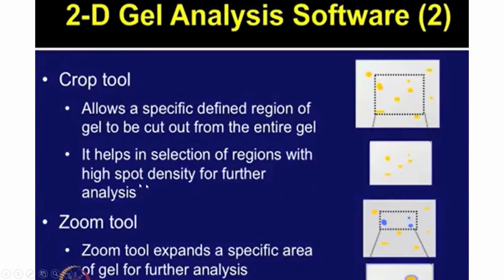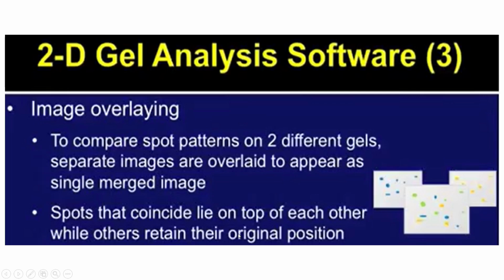So these are certain software applications, like it has a crop tool. You can take the desired image, whichever you are interested in. You can zoom into one of the specific areas as well for further analysis.